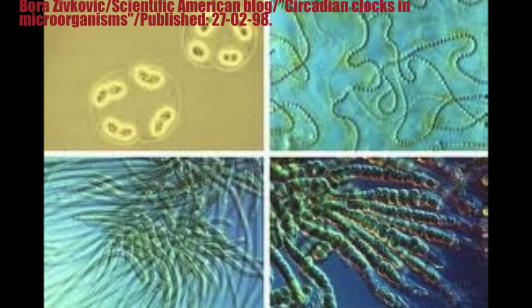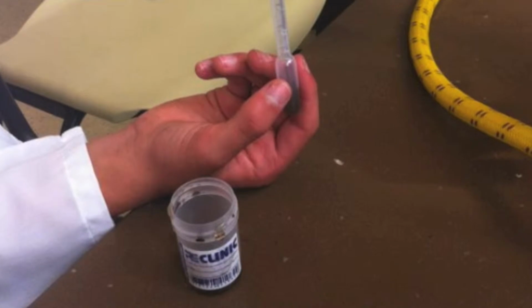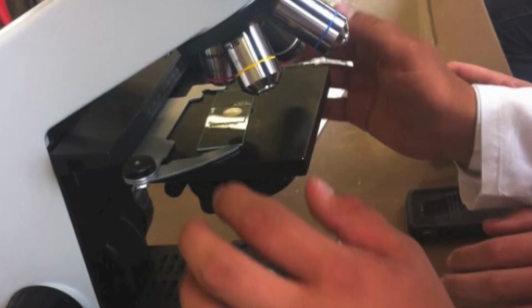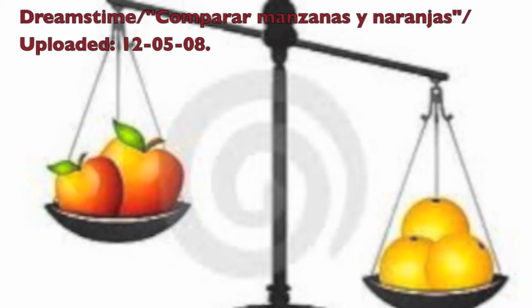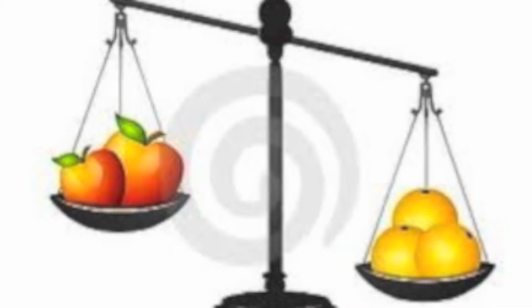All of these microorganisms were seen in different water samples and in different powers of the microscope. To analyze differences and comparisons between samples, we swapped samples between the teacher's samples and ours.